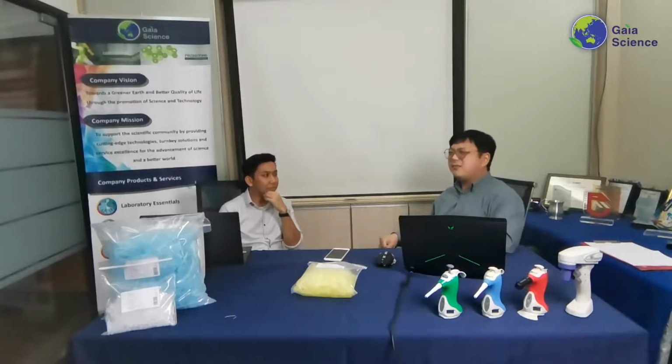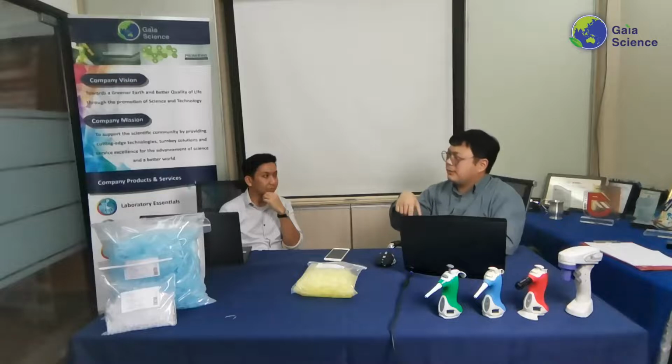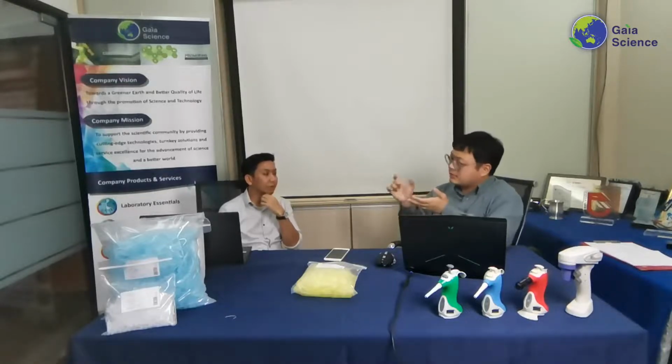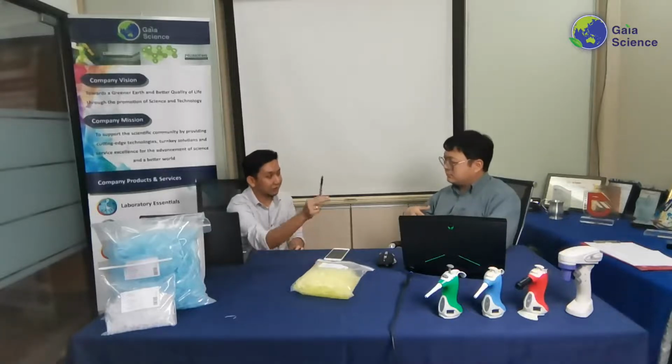Do I use it every day? No. But if I'm not mistaken, the only size it comes in is normally 200s. That's because the amount that you normally aspirate and dispense for this kind of work is around 200 microliters. I see. Alright, so let's say I get a normal tip, and I cut it using scissors, will it work?